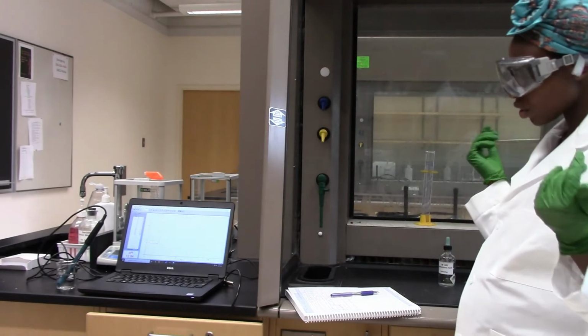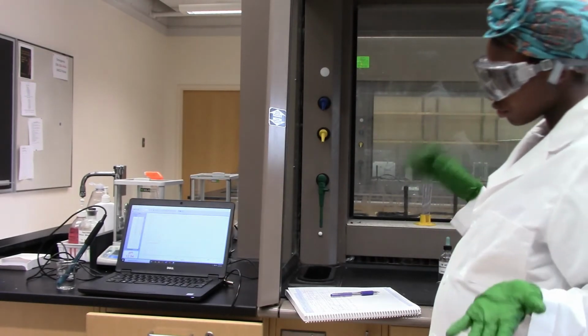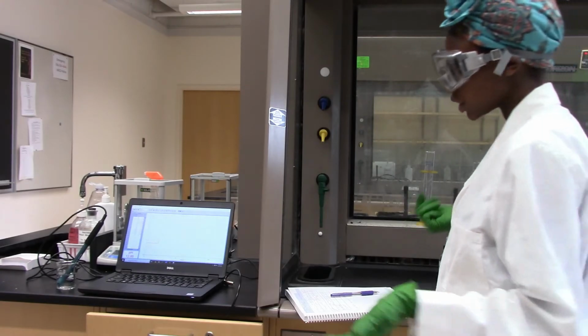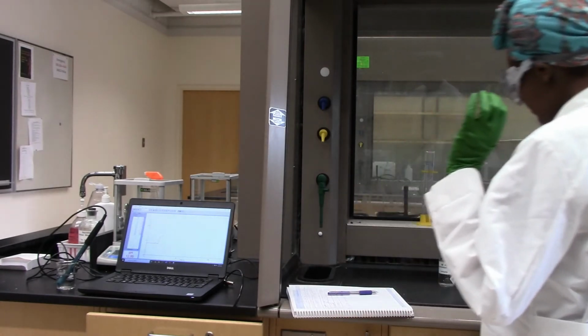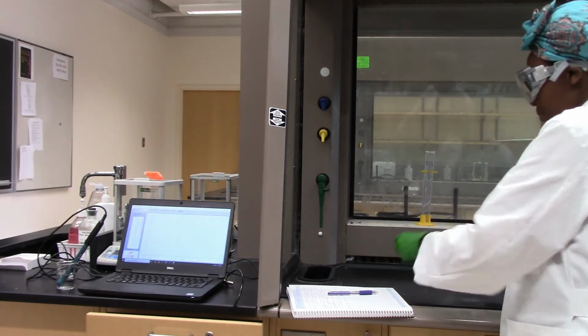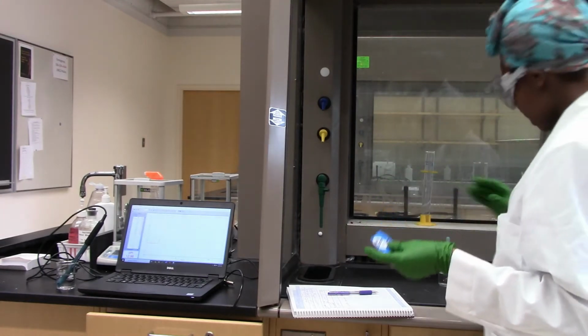Okay, so for the addition of sodium hydroxide, we started at a pH of 4 and ended up at a pH of 12.83 when we added a full drop of sodium hydroxide. So now we are going to add the acid and the base to our buffer system, which we have made from dissolving 1 tablet of the Alka-Seltzer.